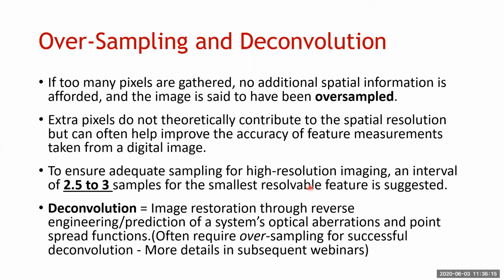A lot of software now has buttons that you don't even have to think about. You can just click on it, and given your particular circumstances, the lenses, filters and wavelengths involved, it will fix everything for you to make sure that you're sampling properly. So you don't really have to think about it in a lot of cases, but you need to understand why it's doing that.